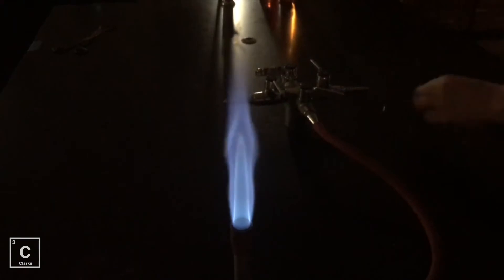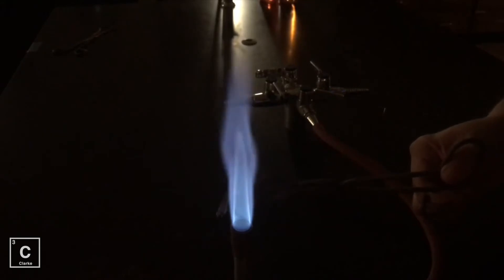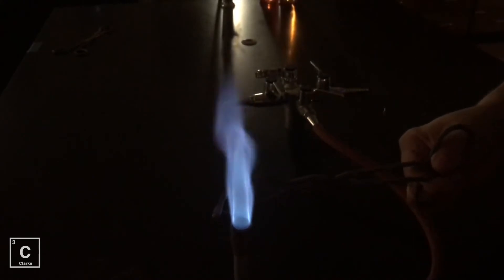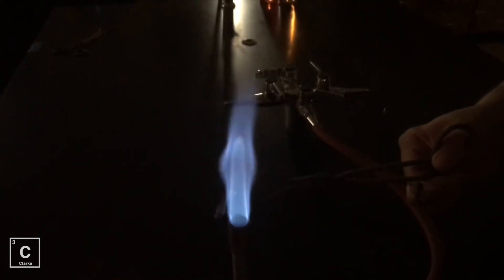Last, I am going to do the base of the flame. Start. At this point you can see that it is still not red. Typically, we can leave it in here for several minutes and it will not become red. You may just record that it is more than two minutes.